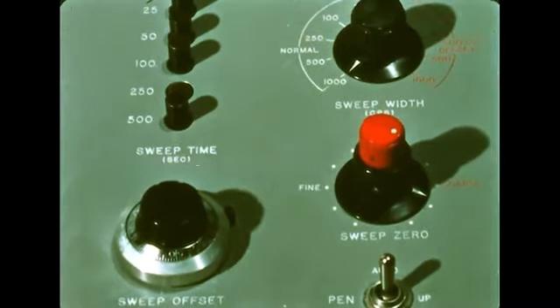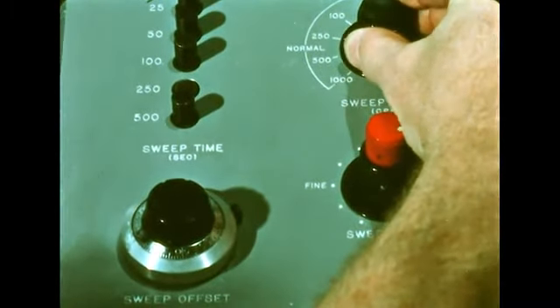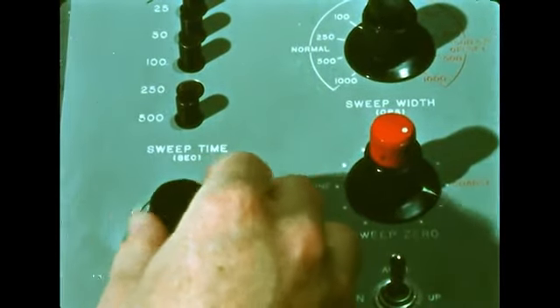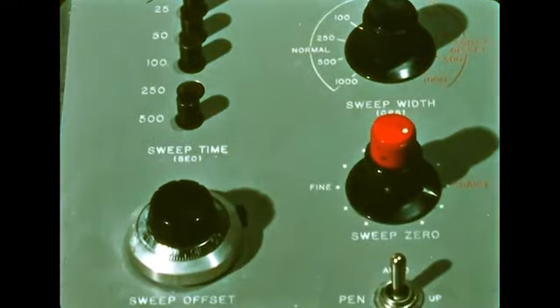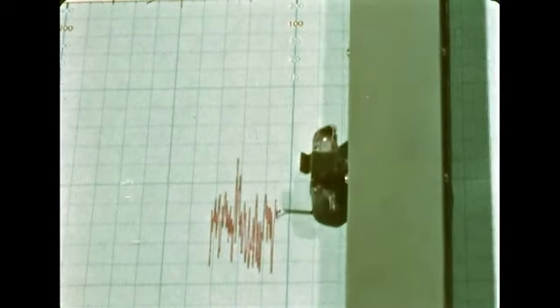Next, the sweep width and offset controls are adjusted. These controls may be set so that the whole spectrum, or any desired part of it, fills the chart. If the spectrum is weak, as with dilute samples, the absorption peaks may be hidden in noise.